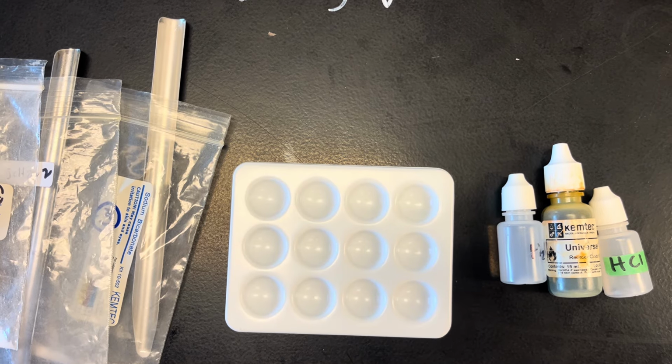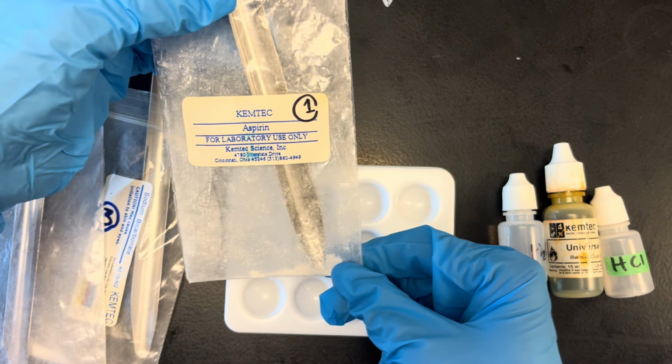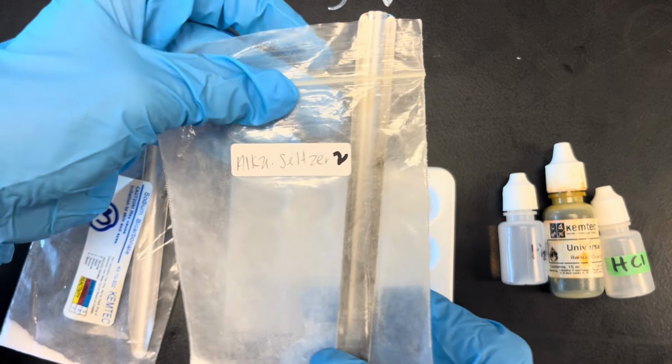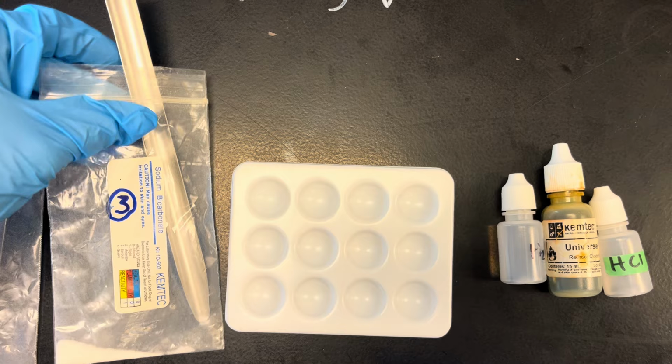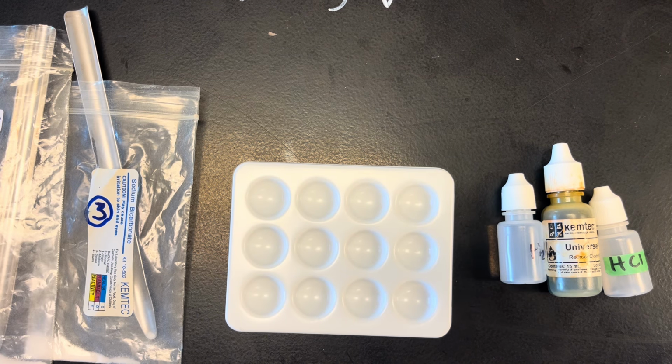So in this lab, you're going to be testing 5 known substances today, and then 3 evidence or unknown substances tomorrow. The substances will be numbered in the same order that they are in your data table. So the first substance will be aspirin, the second one will be Alka-Seltzer, the third one will be sodium bicarbonate, which you'll notice are all white powders, and then 4 and 5 will be the simulated drugs.